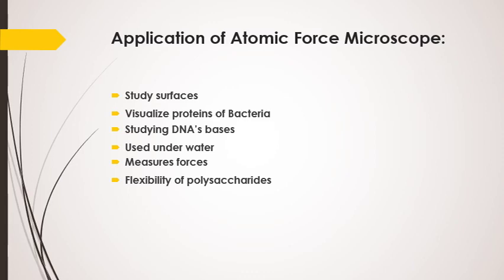The other application is that it is used underwater. It has been used underwater to study chemical reactions at living cell surfaces, which helps to confirm chemical analysis of the cell wall material.